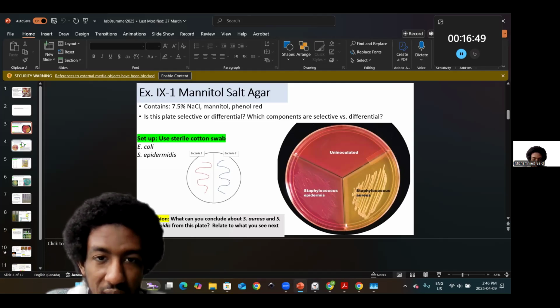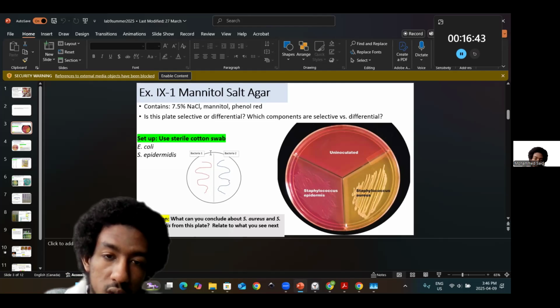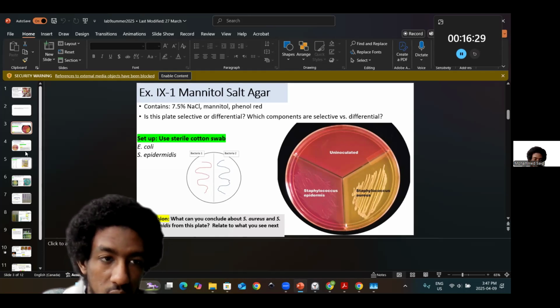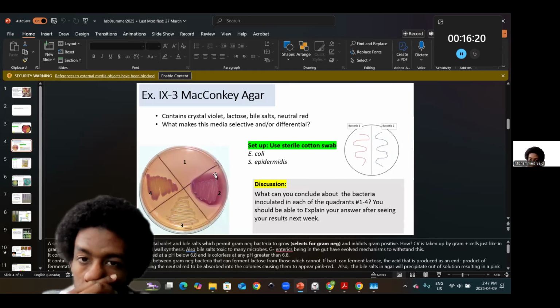That way you could analyze other properties of bacteria using similar or unique selectable and differential components of media. So that really, I hope, gives you a rundown of the setup of the lab, and also, inshallah, to highlight importantly in your methods that we dealt with 3 sections to keep one as a control, right? Avoiding cross-contamination as shown here. But bear in mind that when you did these cotton swab streaks, you didn't spread too close to other sections, to avoid the risk of cross-contamination once again, right? Like here. So even though this is the control, just bear that in mind.